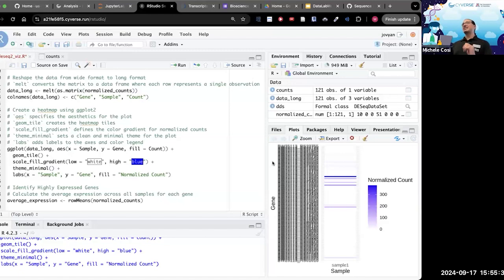What did it give us? Essentially that those alignments contain some genes. This is not so good. This is actually extremely bad. Why? Well, it tells me that I've essentially cut out a lot of the fat, trimmed out a lot of the fat, and this might not be genes that are of relevance. These are just the genes that exist in those samples.